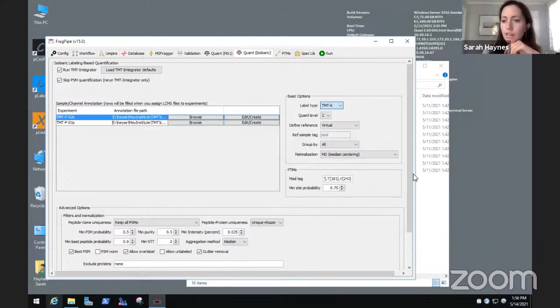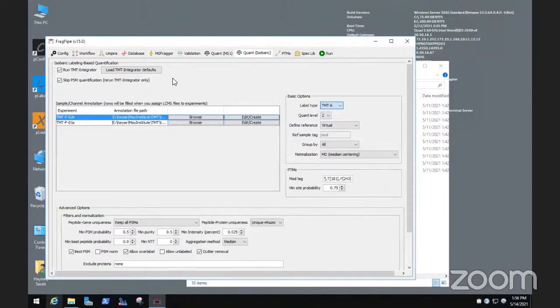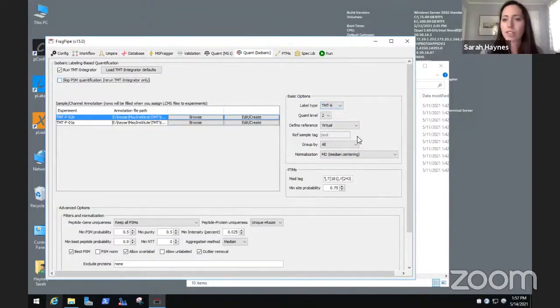So I don't know, I guess it's 1:56. Do we have time to, Alexey, do you want to show the DIA workflows? Well, let me see if I can quickly answer if there are any other questions.